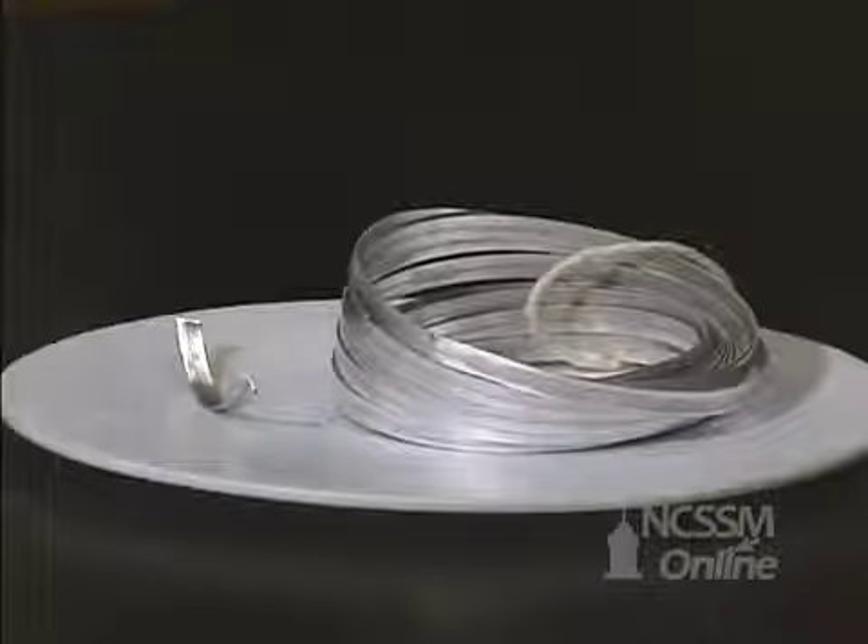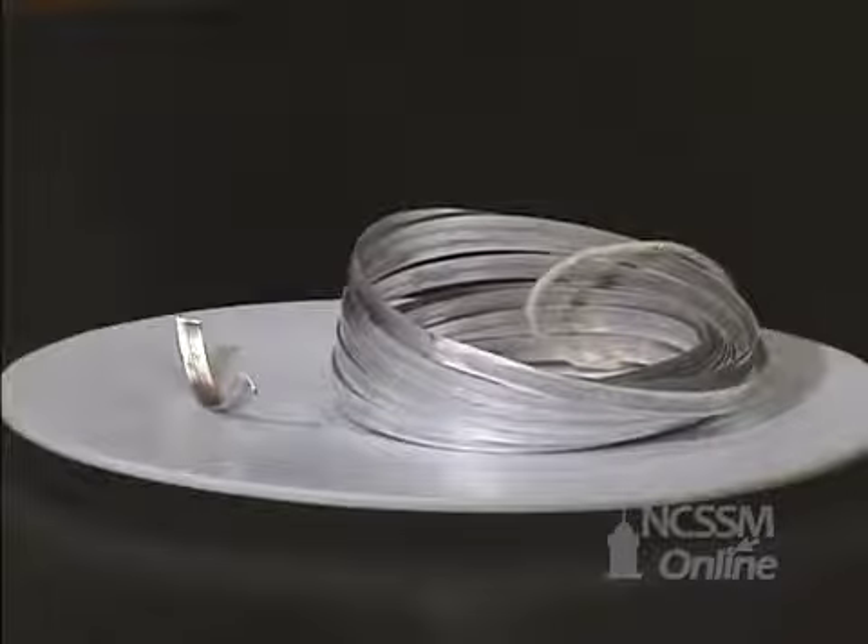One thing that's very apparent is the difference in how we store the metal. Magnesium is not stored under kerosene or mineral oil — it's stored out in the air. Even after being stored out in the air for months, the metal still has a very shiny surface.